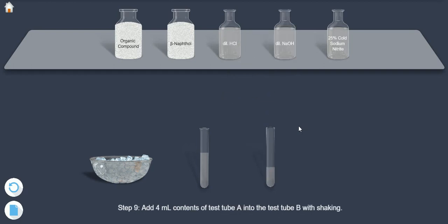Step 9: Add 4 ml contents of test tube A into the test tube B with shaking.